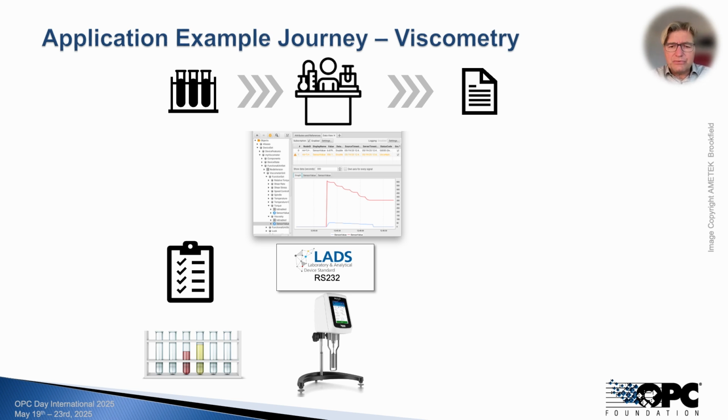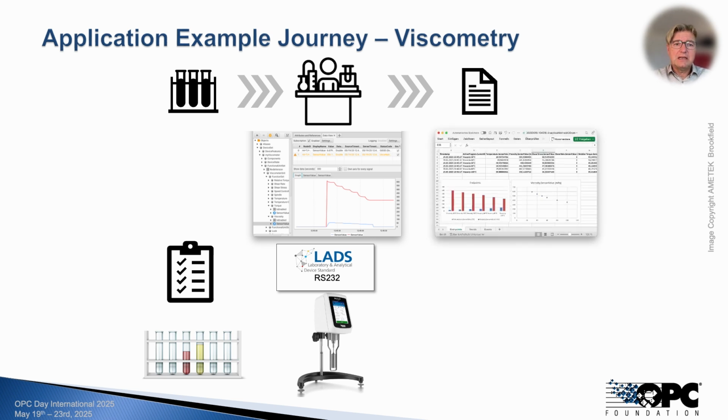This already allows the user to monitor and control the device using standard OPC UA tools. They've taken a great first step, automating what used to be a manual process. The user can now access live data, extract results as CSV, and even use that in an Excel sheet for documentation. The feedback is something like, "I'm happy, I have automation, I get the data through OPC UA."